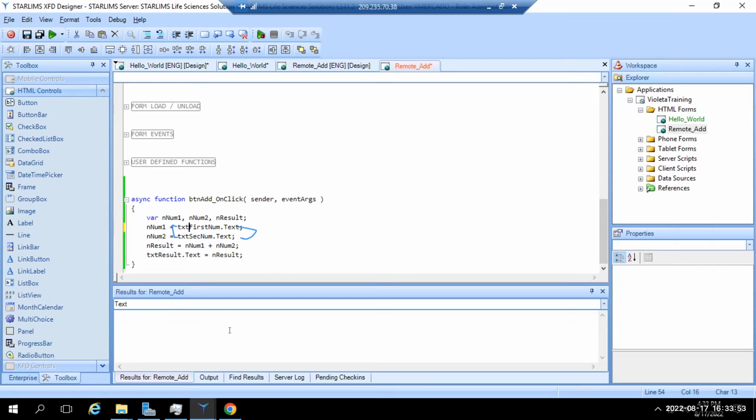So in front of it, start typing in with a capital I. Sorry, capital I. 32. Let's just do 32. It gives it more length. And then dot.